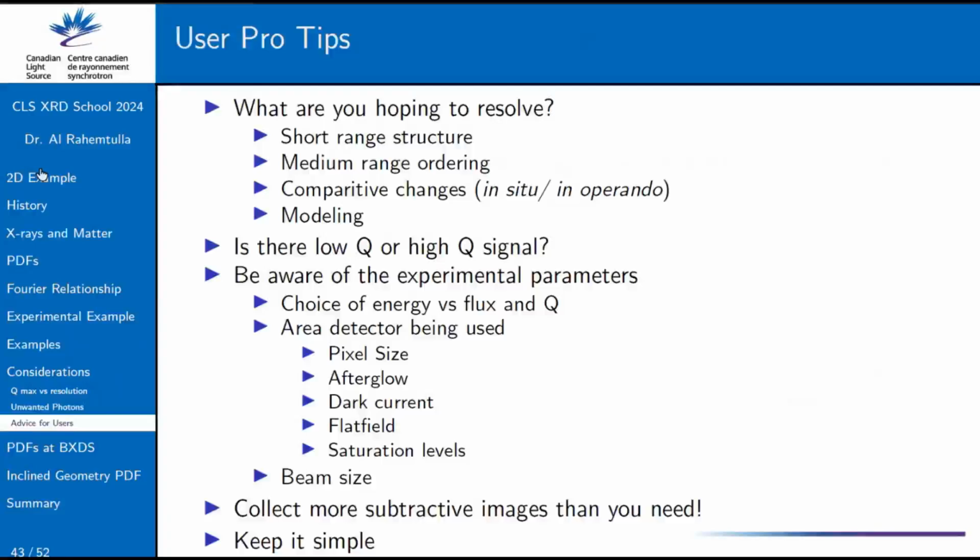If you're really focused on something, you can change up your experimental parameters, but the easiest thing might be getting one good setup where everything's consistent and you're going to get consistently good data, and you'll have a ton of backgrounds, you'll have a ton of data. You can really check if something's weird with your sample or something was weird with the setup, and you'll know that ahead of time, rather than going through a setup change on every sample.